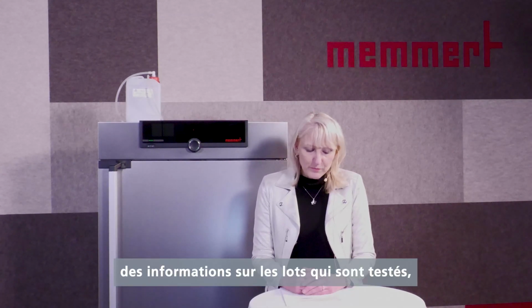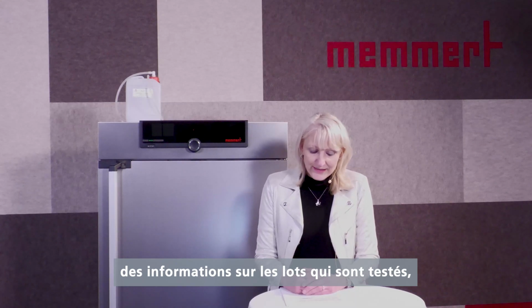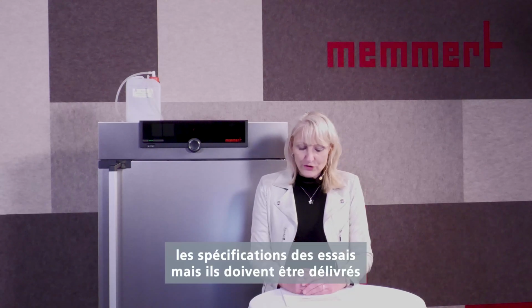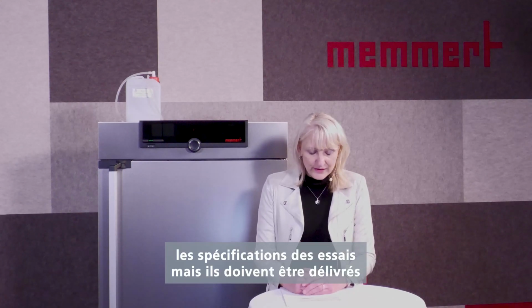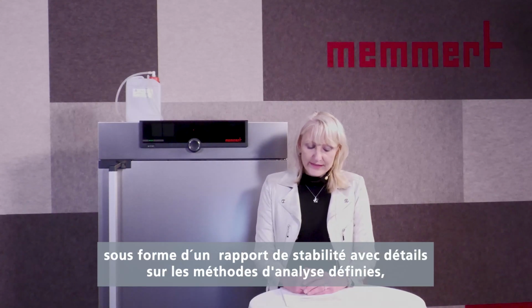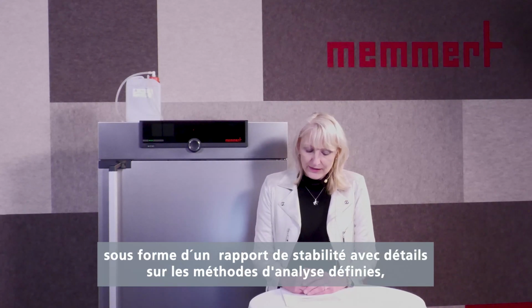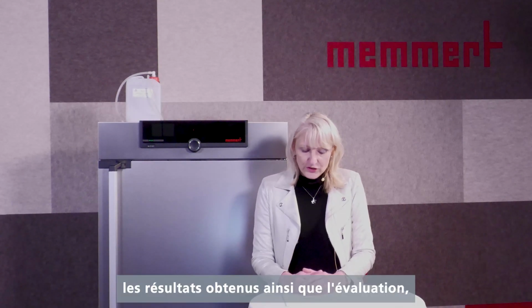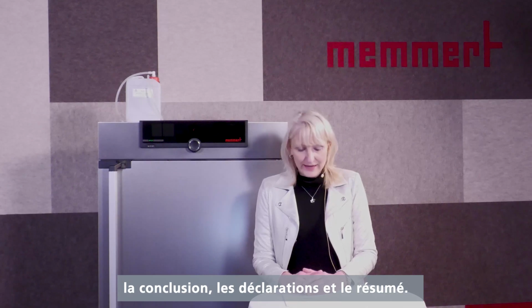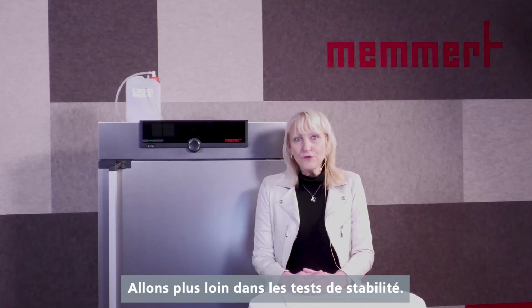There will be given information on the batches which are tested, container closure system, storage condition, storage period, testing specification. Also, they have to issue a stability report with details on the defined analytical methods, the results achieved, along with evaluation conclusions, statements, and the summary. Let's go further to stability testing.